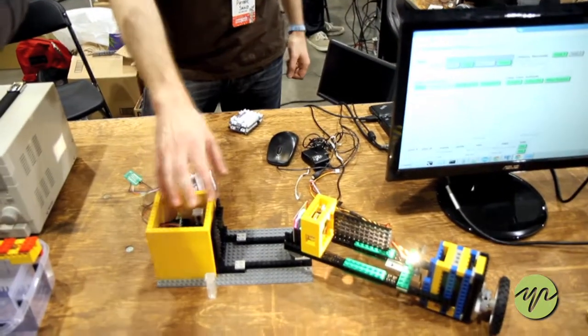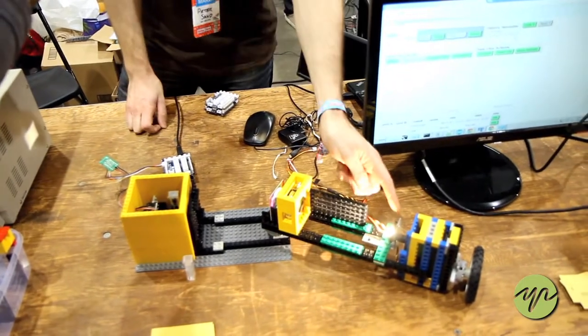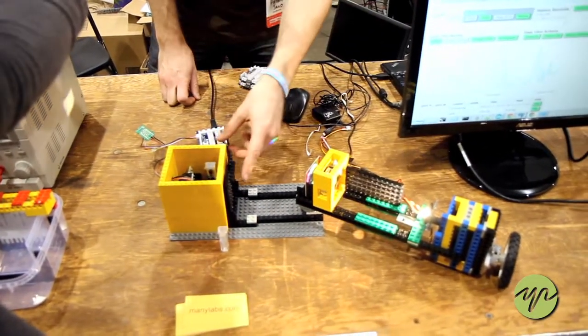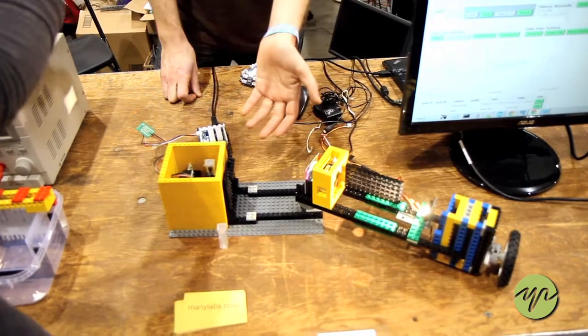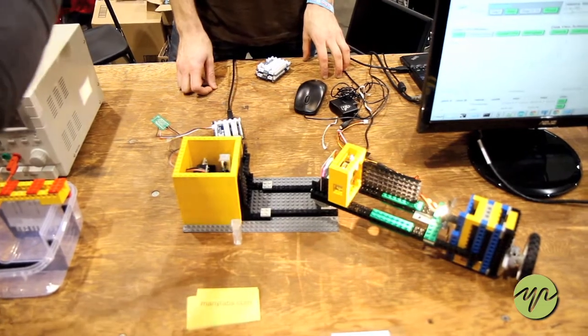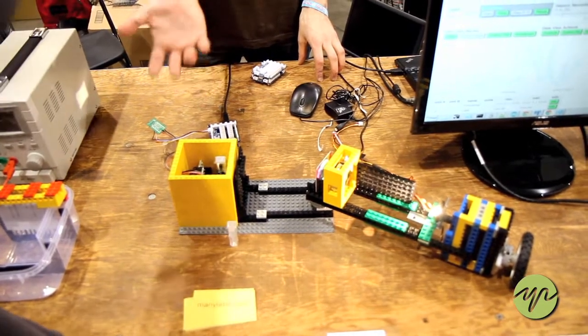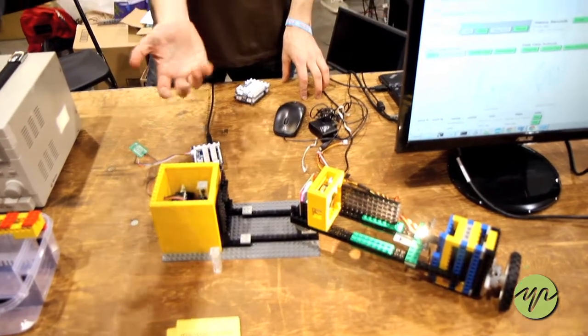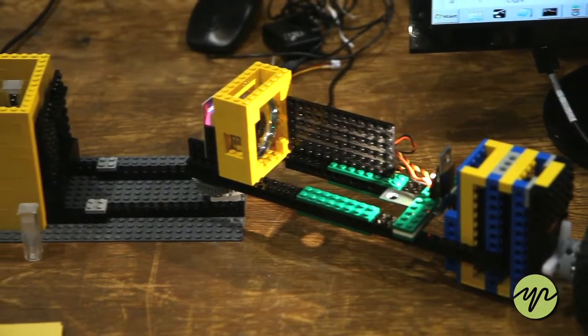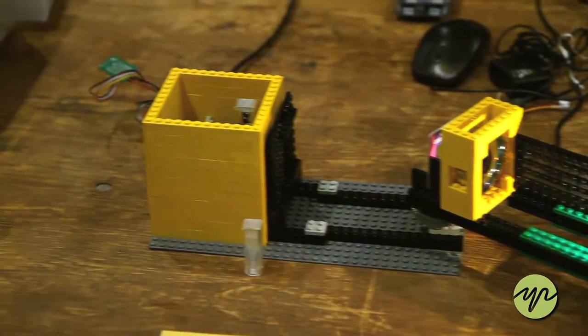This is connected to a light sensor here — this is a spectrophotometer. There's an LED here and some optics that cause it to project a spectrum of different light colors. This is a tool you could use for physics, chemistry, and biology lessons. It normally costs hundreds or thousands of dollars, but the parts for this one are $20 or $30.